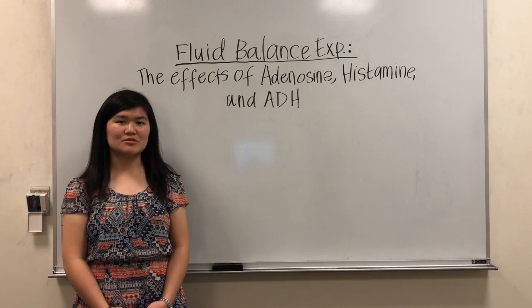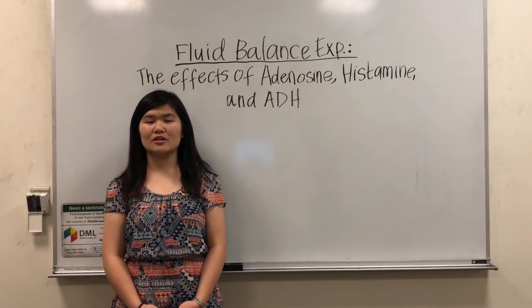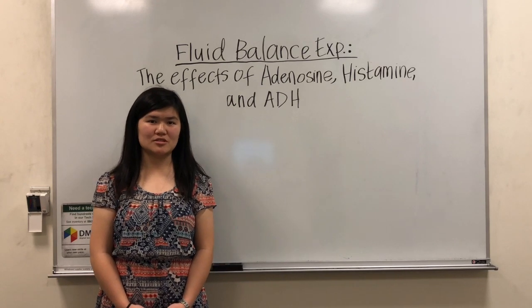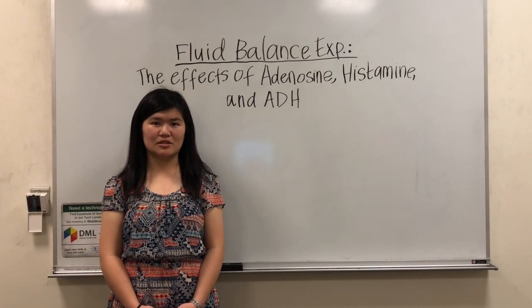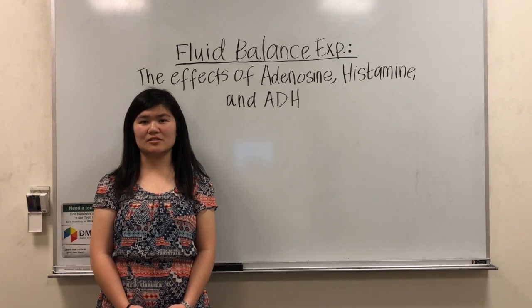In terms of methods, we used the same setup as the fluid balance experiment done earlier in the quarter. We perfused different solutions containing adenosine, histamine, or ADH through the frog's aorta to study the effects of the different drugs.